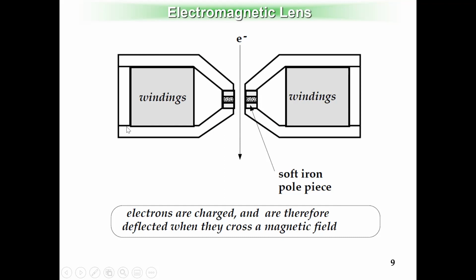And the electromagnetic field will deflect your electrons, just like the convex lens. And of course, the stronger the electromagnetic field that you enable in this wire, which can be controlled by the current density, the more deflection you can exert on those incoming electrons, and the higher magnification you can achieve.